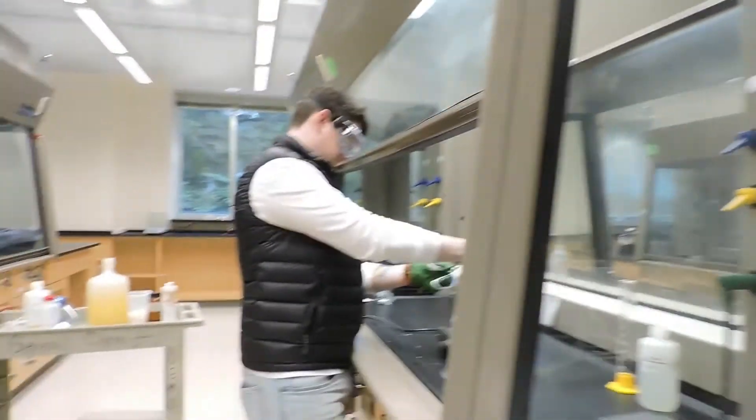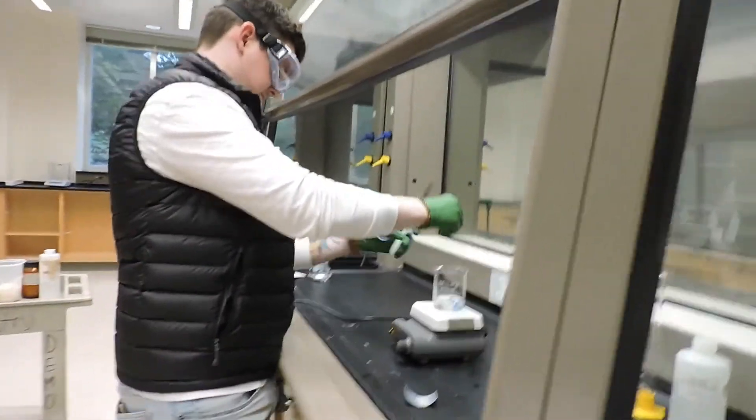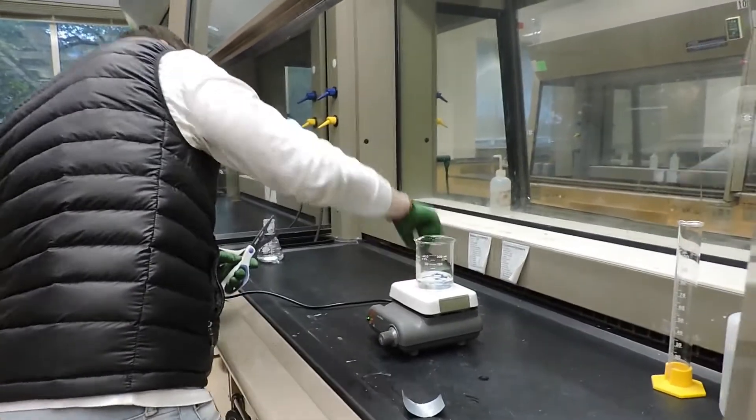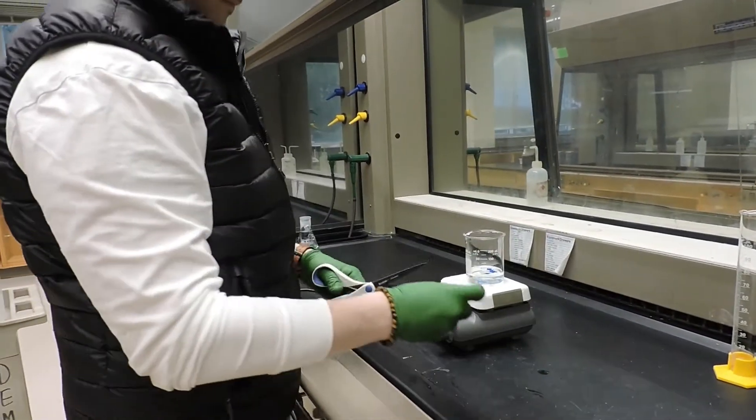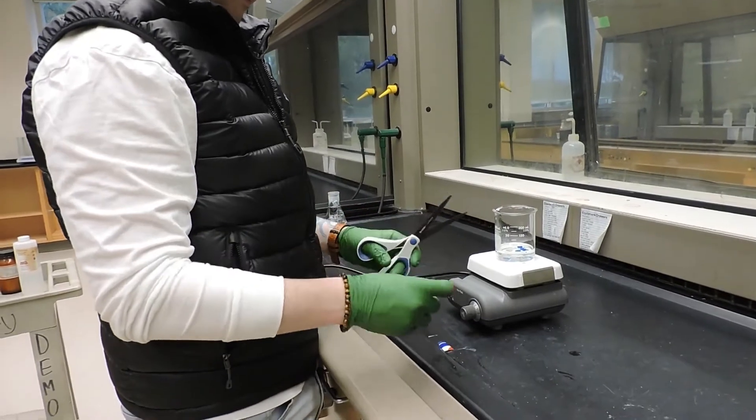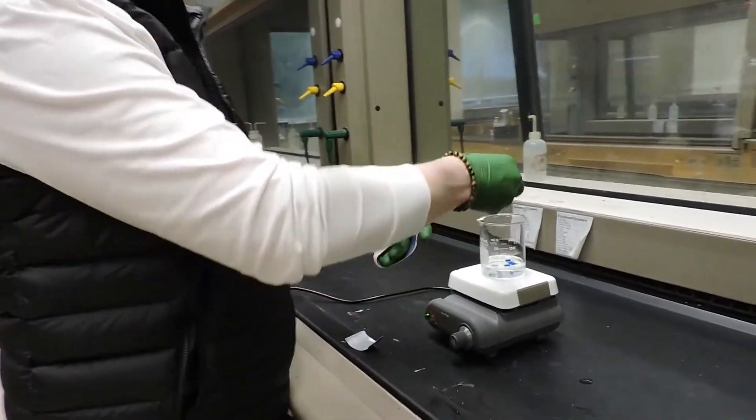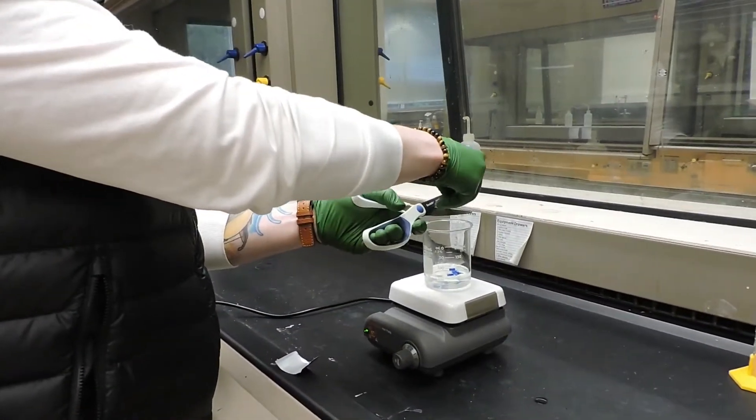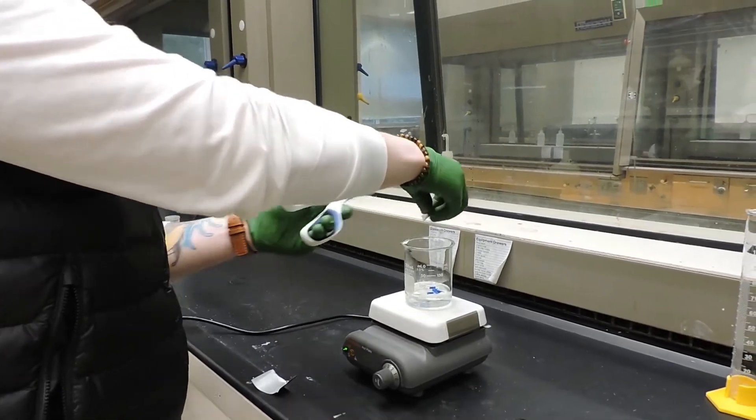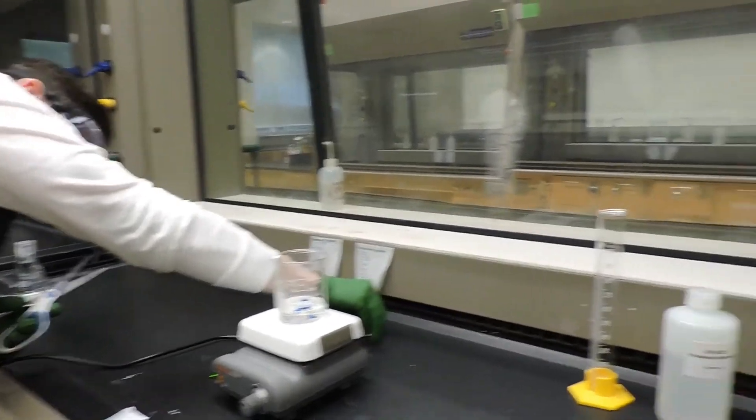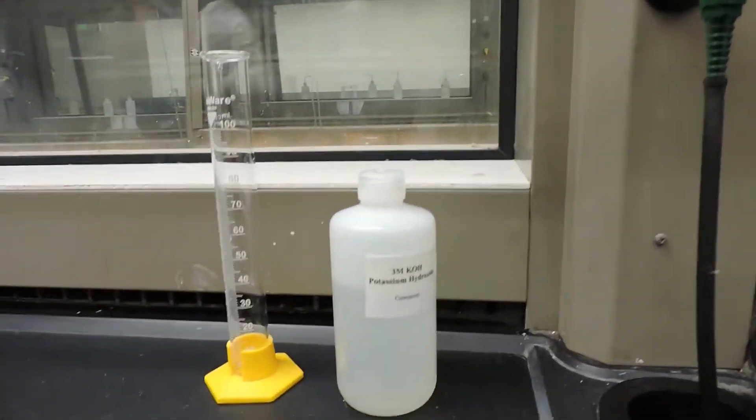So now he is cutting it into several small pieces, putting them into a clean 250 milliliter beaker. He has already added 25 milliliters of water and 25 milliliters of a 3 molar KOH solution.